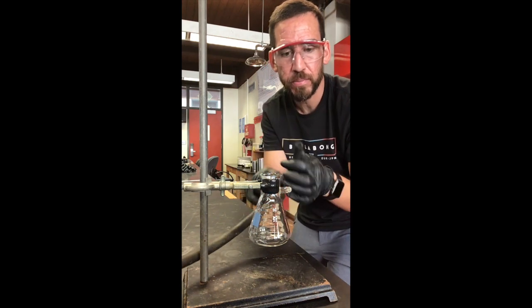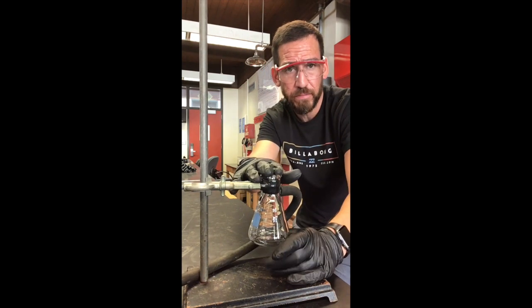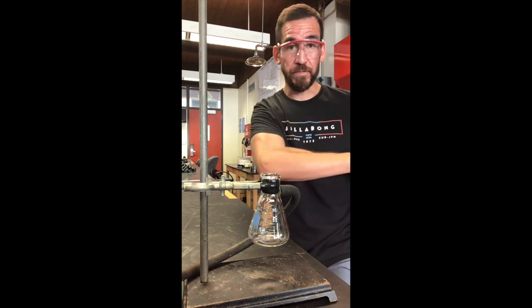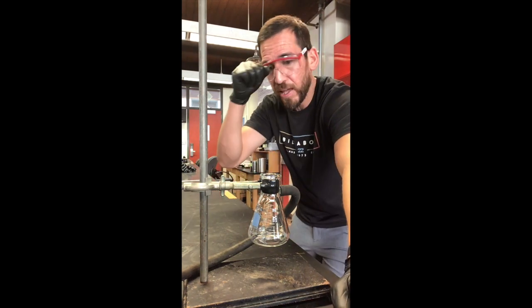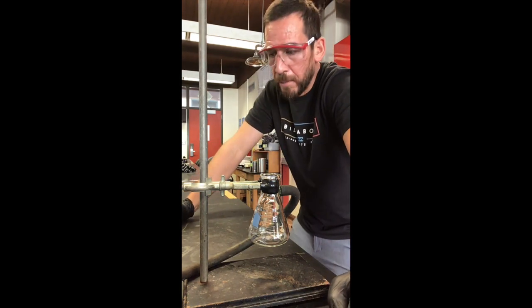We've got this vacuum tube, and you don't want to connect it until after you've clamped this vacuum flask, because these vacuum tubes, since they're so rigid, have a mind of their own, and they just go like this, and then they take your flask and smash it onto the lab bench. Then you broke your glassware, and you're super bummed because now you have to pay for that, and there's glass everywhere too, so we don't want to hurt ourselves.